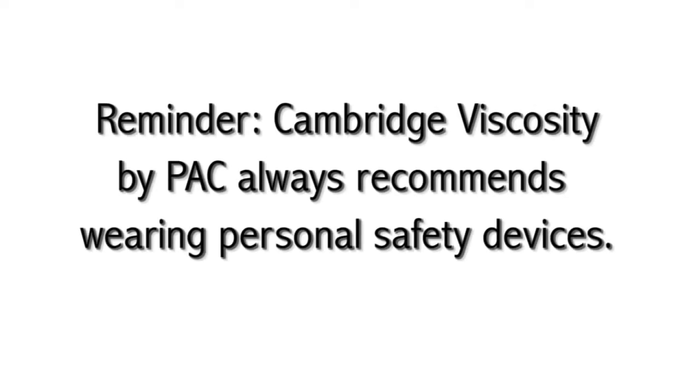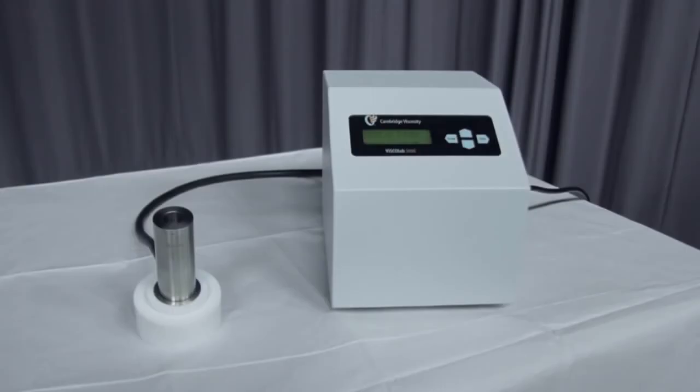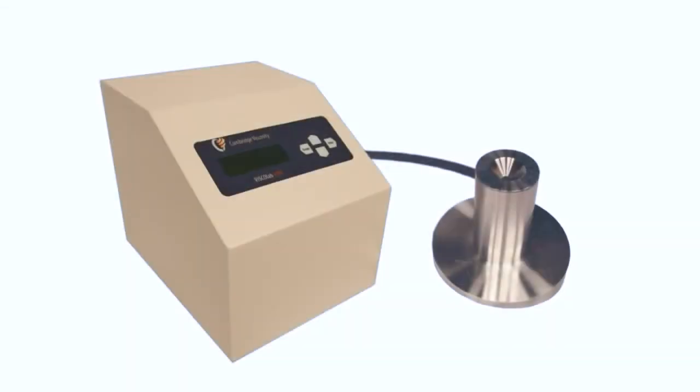Reminder: Cambridge Viscosity by PAC always recommends wearing personal safety devices. The following video will show a user how to test a sample with the VSCOLAB 3000 and VSCOLAB 4000 systems.